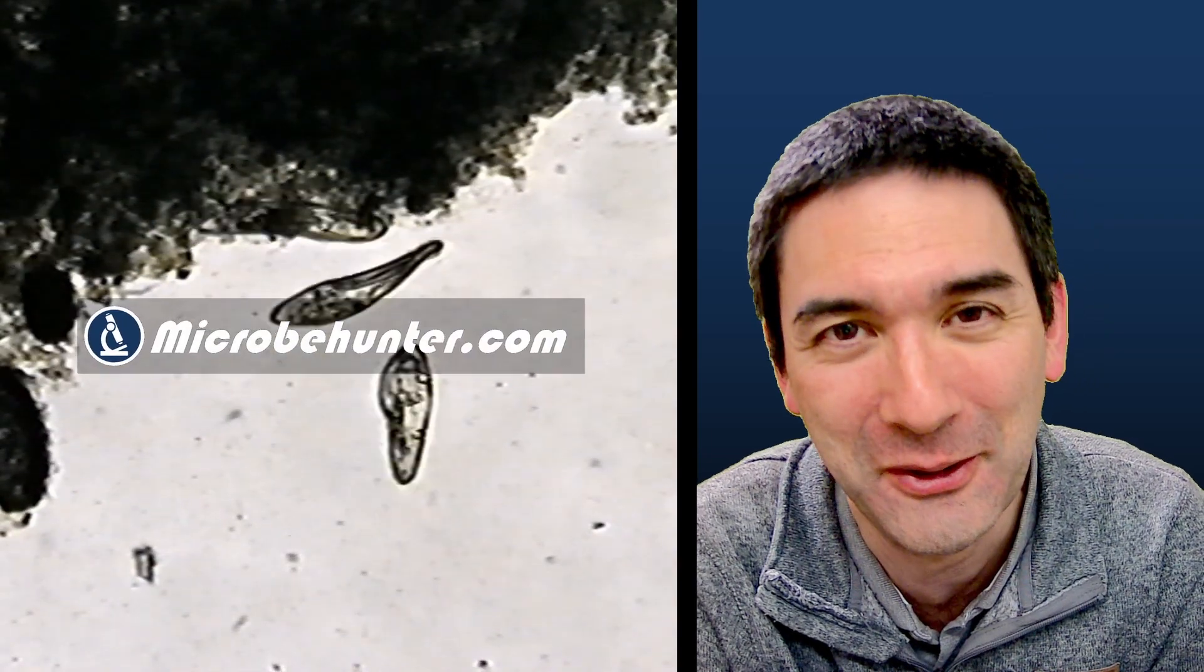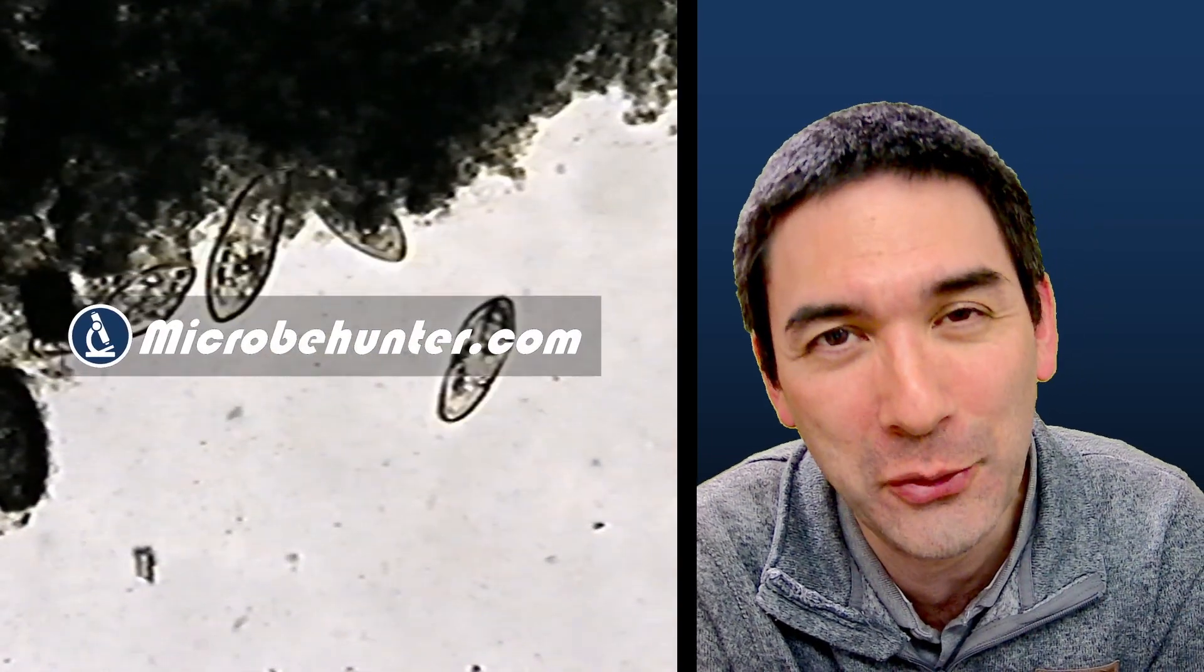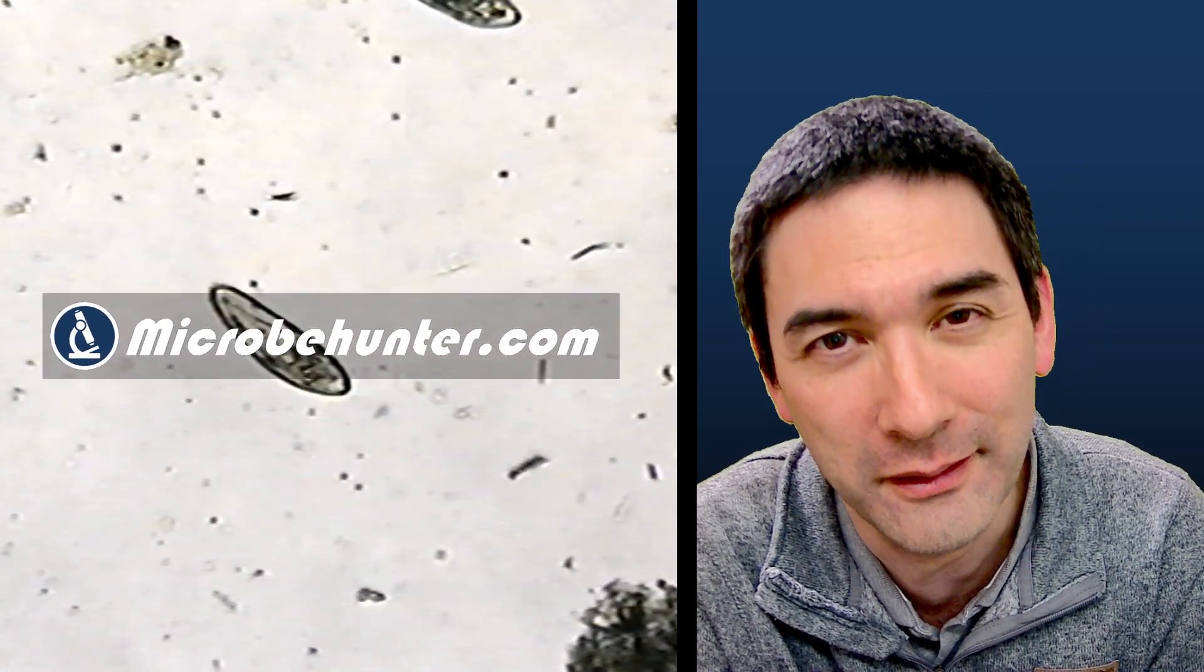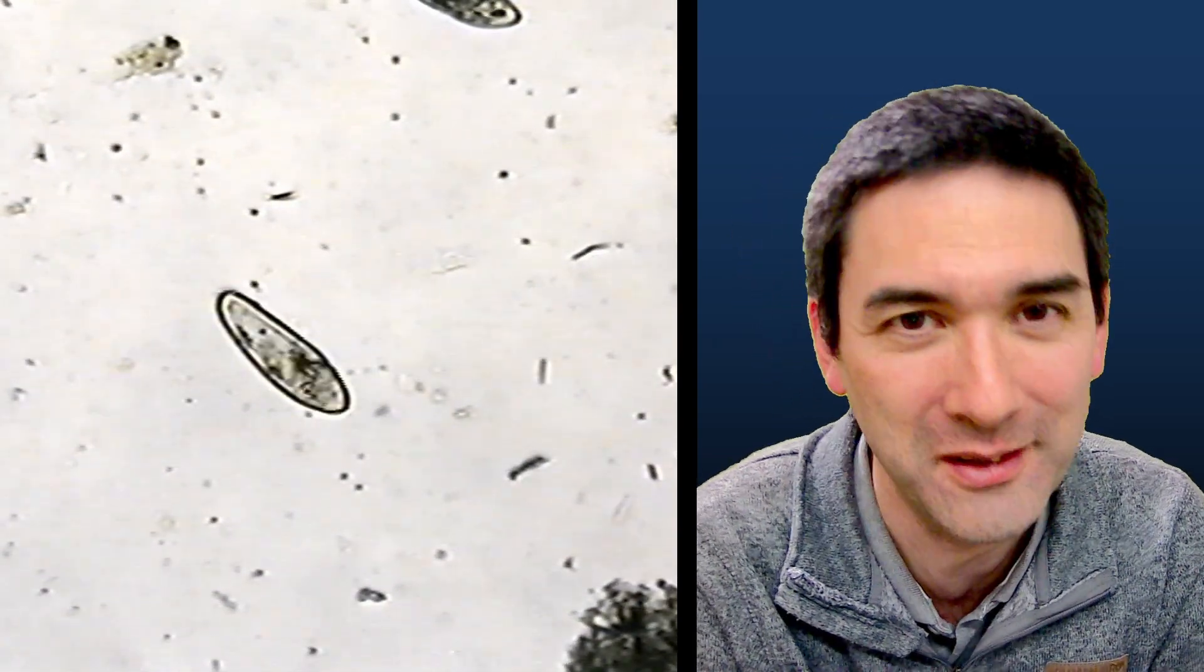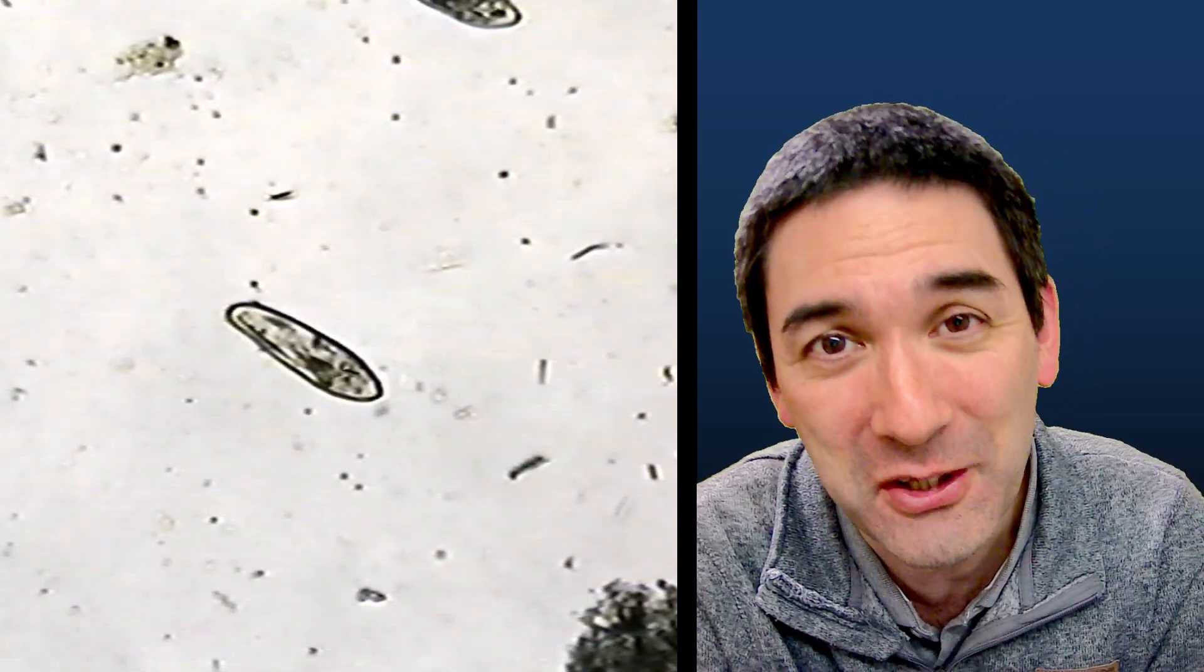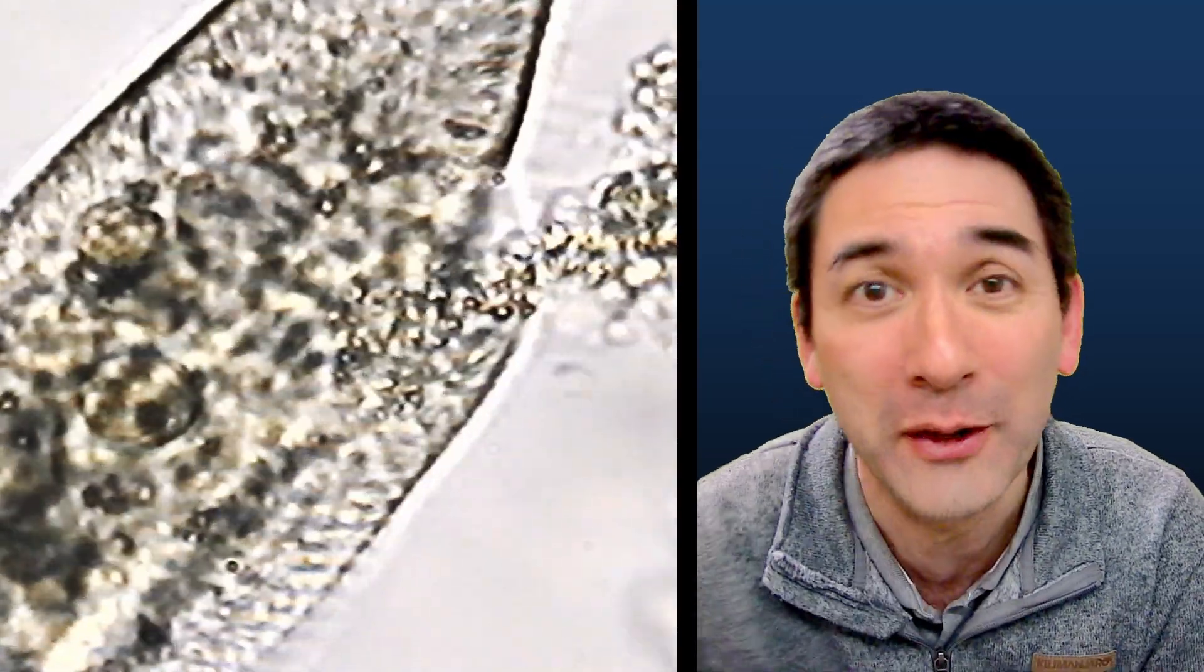Hello and welcome, microbe hunter here. Today I'm going to show you pooping and dying of microbes because these videos that I've got over here actually are quite old.